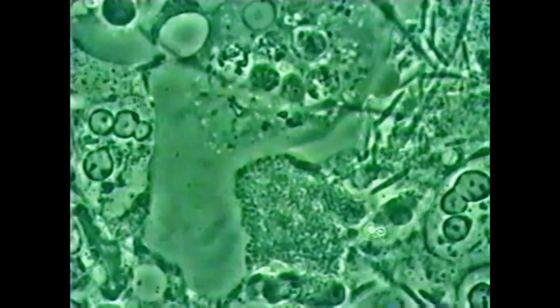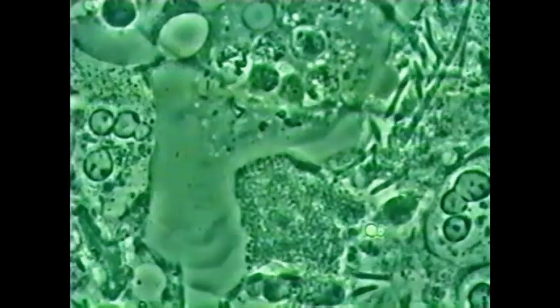So we have to get rid of those bacteria, get rid of those parasites, get rid of those amoeba to cure the condition. Here again, many bacilli, and in the center, amoeba, Entamoeba gingivalis with pseudopod. Oh, here we see one Trichomonas. So this is Trichomonas tenax with 4 flagella on the lower side.